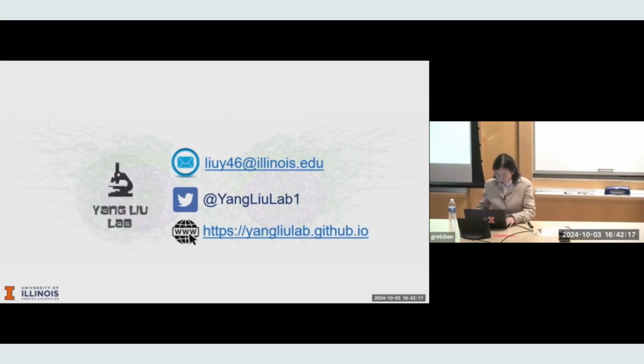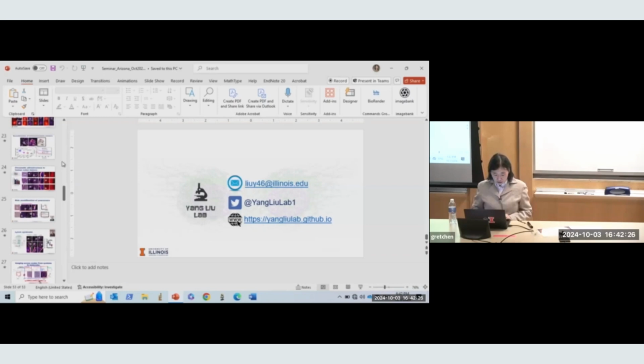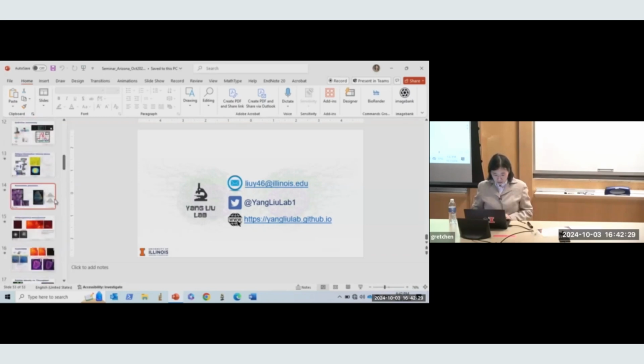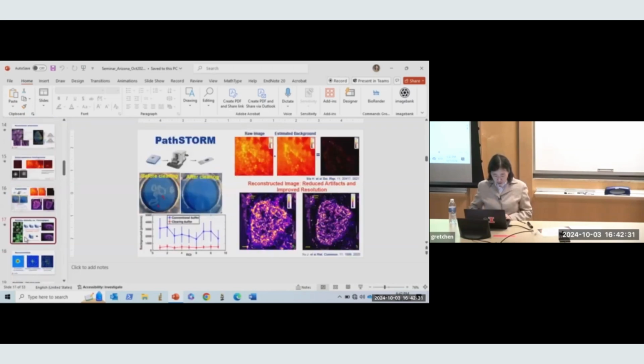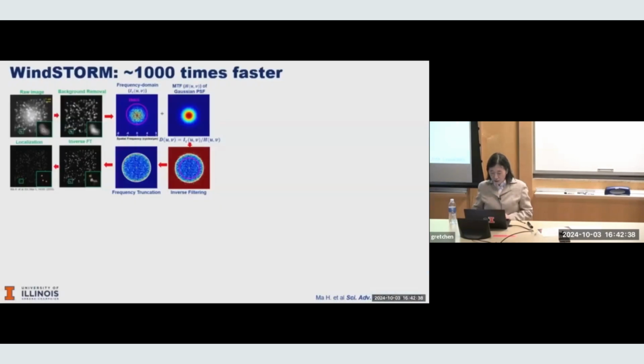So the one critical step, if you see the slides, is a step that truncates the high frequency noise. That is critical. Let's see if I have that. I think this one, right? So this step here. Otherwise you will have higher values. This red area here is red because it has very high values, since these are really high frequency noise. So that part gets truncated, so that you end up getting this component.